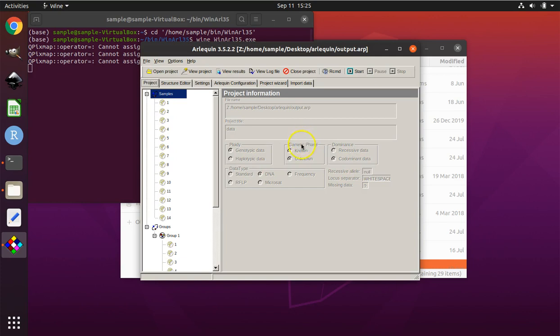But just so you know, it is possible to have your diploid genotype data be what's called phased, where the gametic phase of the data is known. But I have it imported as unknown. Again, that's something you can't change. That's something that's set that way based upon the way that we converted the file in the previous tutorial. But I think that's the right way to go.